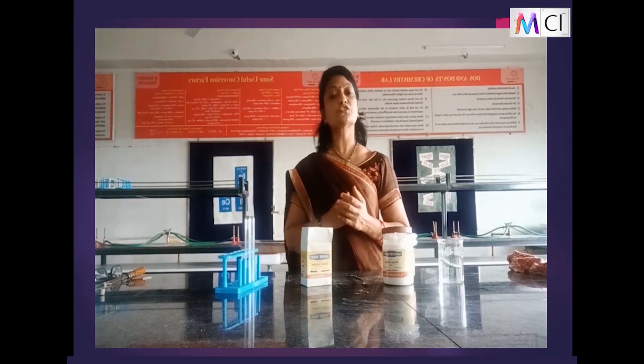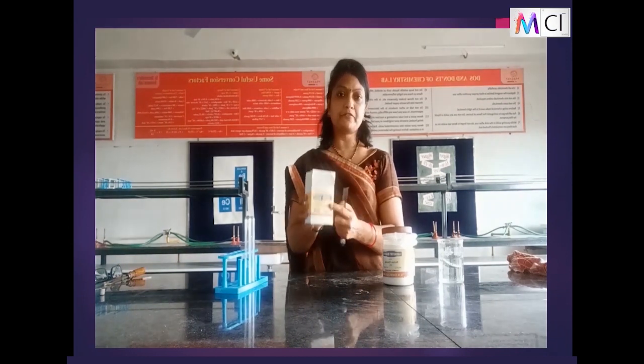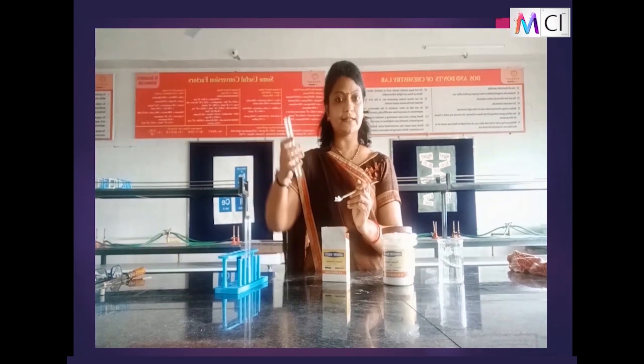So what is a precipitate? It is an insoluble substance which is formed in the products, isn't it? Let us observe this with the help of an example, that is, perform the practicals. Here I have sodium sulfate for you, and it is a white color amorphous salt. I take this in a test tube.